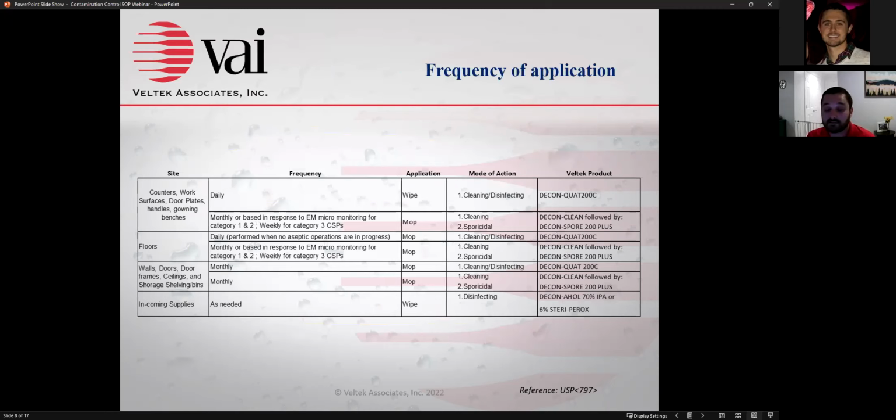A fun fact is, if you ever order a spore from ATCC or one of those services that will ship you spores for lab testing per se, they actually send you the spores in an IPA solution. So it keeps them only spores. Just something to throw out there.